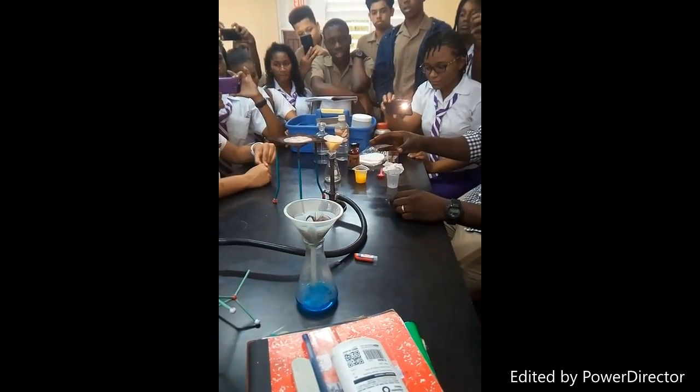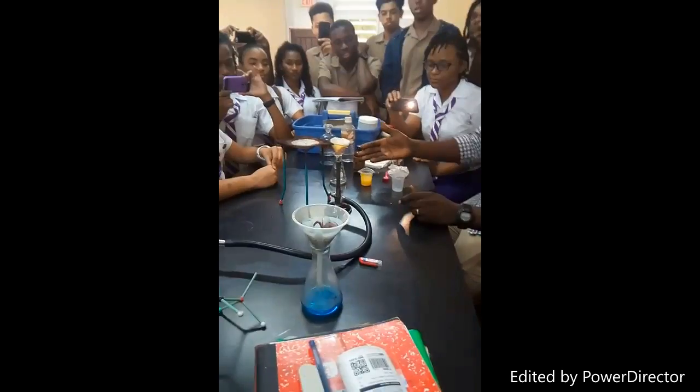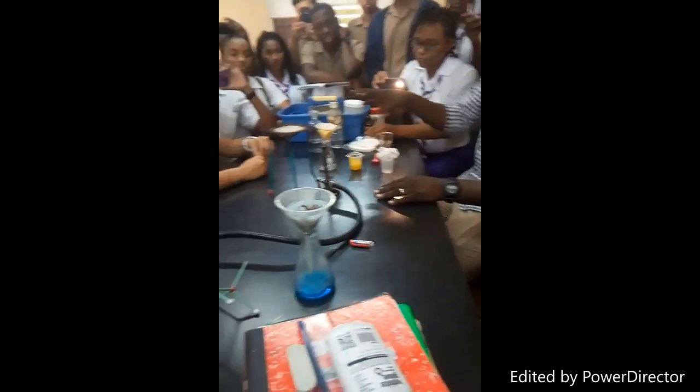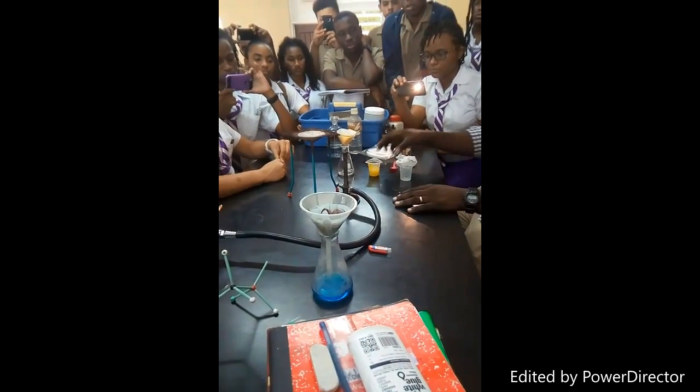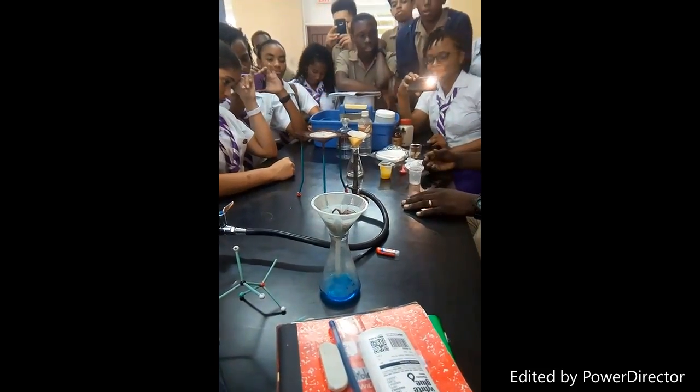The filtrate is colorless. Let me just refresh your memories. When you're filtering, the substance coming through the filter paper is the filtrate, and the thing left in the filter paper is called the residue, just in case you did not remember. It is colorless, which means that we're doing well.